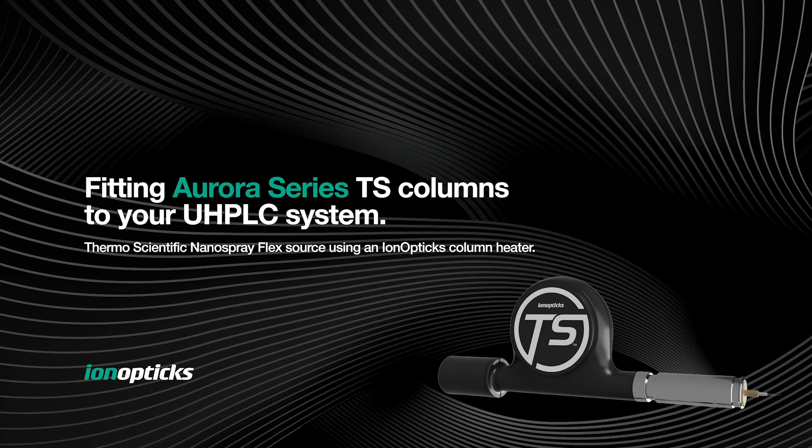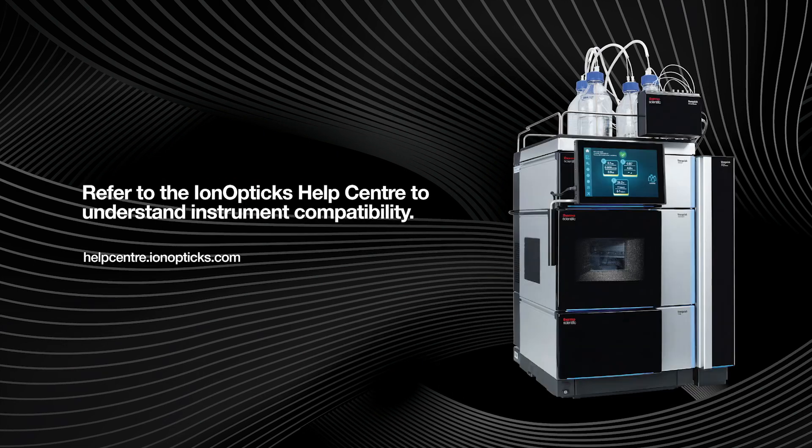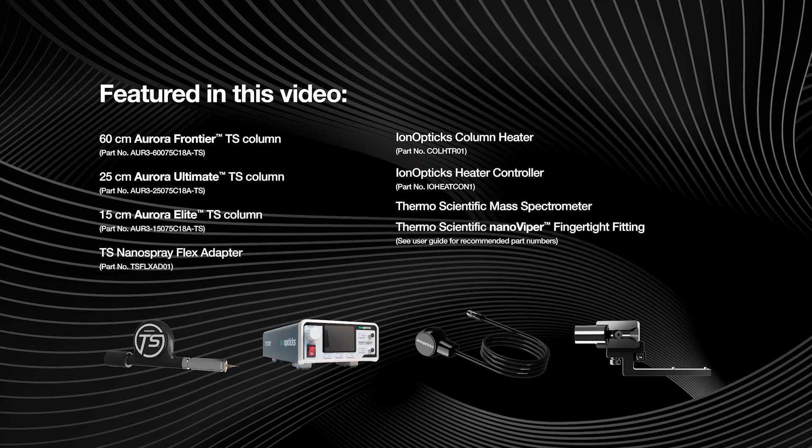This video demonstrates how to fit an iron optics TS column to your UHPLC system for the Thermo Scientific Nanospray Flex source, using an iron optics column heater. Listed here are the products featured in this video.